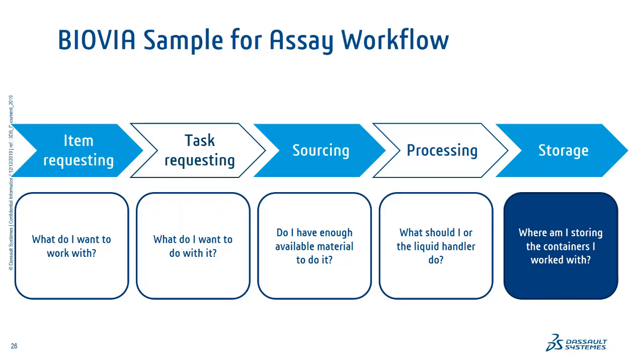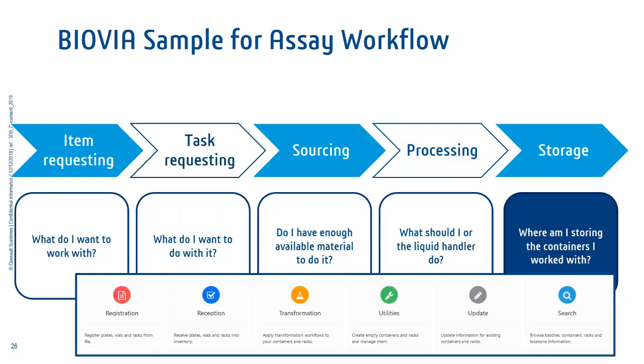So Sample for assay is really about defining the parameters and the configuration of those different workflows. Here is just a quick screenshot of the UI itself. That is the front page you see when you connect to Sample, with the different typical tasks, which come from the simplest ones, which are registrations, which is quite often actually handled directly by connections between some initial system when it comes to registering batches, and can be plugged into some other system that will push the information into Sample.